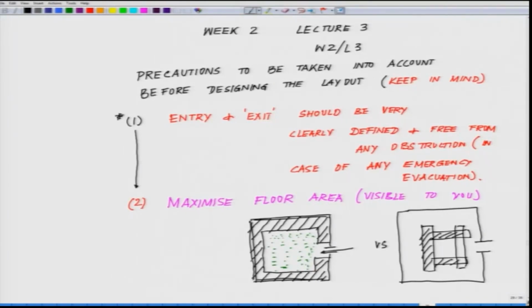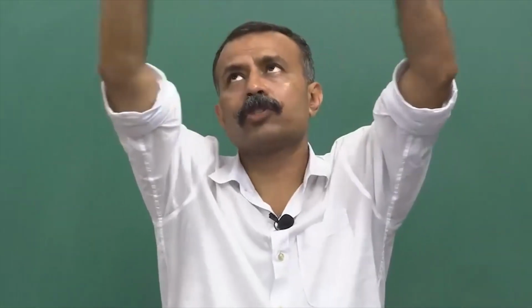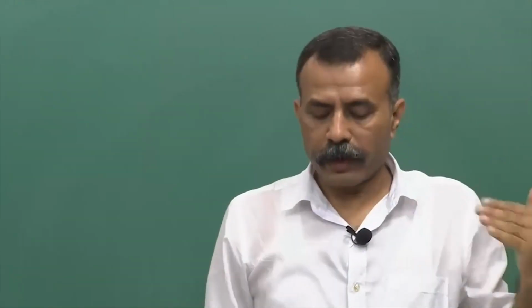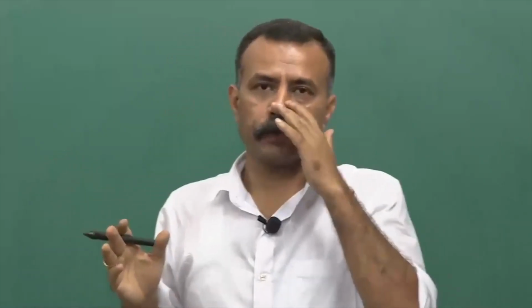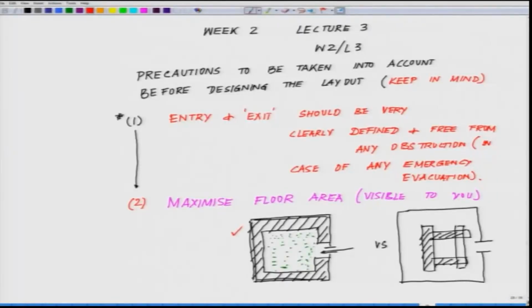So, what you can do, you could have your working bench like this, and you have all the storage area on the walls. Of course, one has to be very careful when you set up the storage area, it should not be very high. Or you could make it high, but on the top shelves you can store all those things which you will be needing later, or you can have a complete storage area. This is something I will leave up to you, but this is my most preferred one, where you are utilizing this whole space.